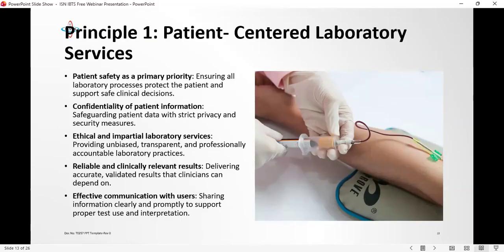But because they need the result to sort out an ailment, if for any reason the result is going to be delayed, even if it is a wrong result that was issued, it behooves you, because you have the patient at heart, to communicate to the client. If possible, reach out to the doctor, because if you do not communicate the result, it's as good as you did not do anything, because you did not meet the final requirement, which is to be used for diagnosis and prognosis for the client and the treatment plan.